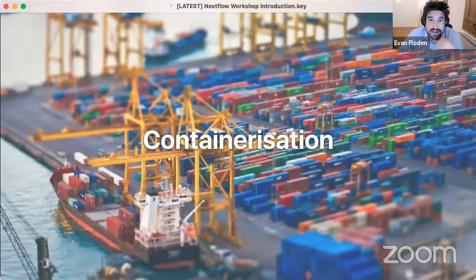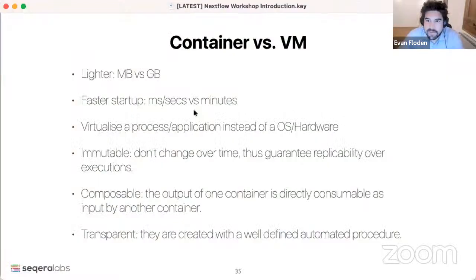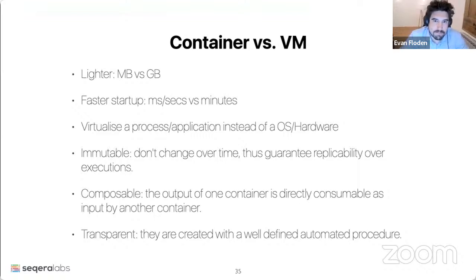And as I mentioned before, containers are key to the reproducibility, but also to the portability of the pipelines. The way you can think about this is that containers were typically developed for long-running web applications. The key application is, say, running web servers. But we've essentially taken containers and tried to use them more in data pipelines. Earlier instances of this, where people were trying to, and still do to some extent, used virtual machines to define all of the dependencies that are required for analysis.